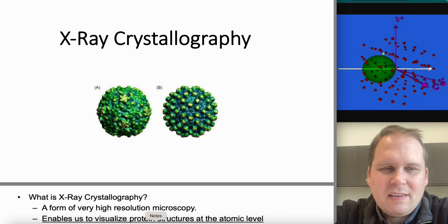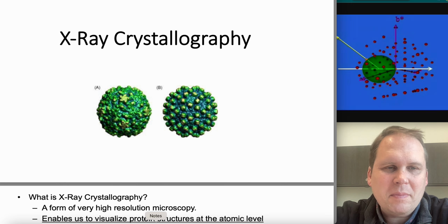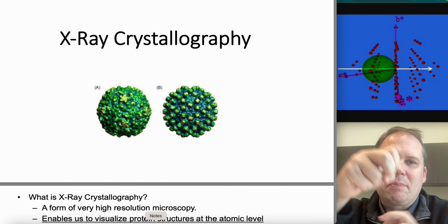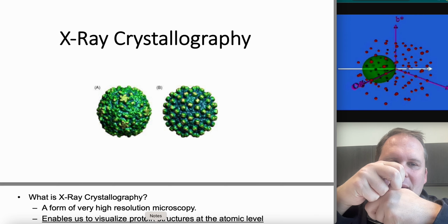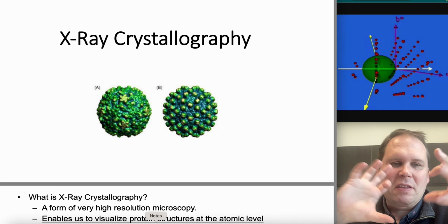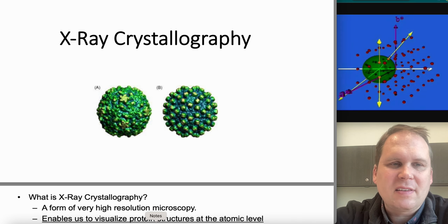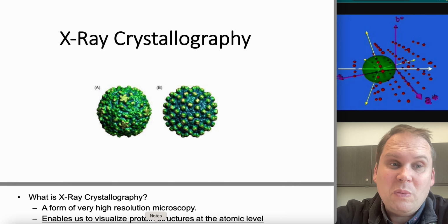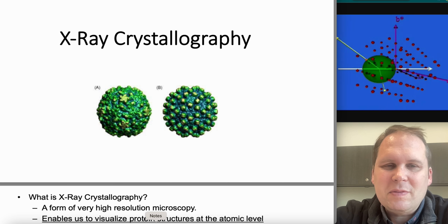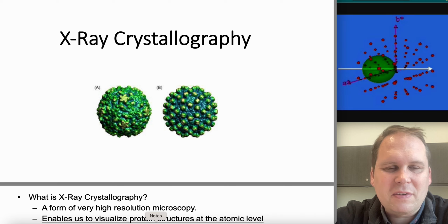That's a technique that works well on any protein that you can get to form a crystal. The crystal will be that protein aligned with another copy of that protein, forming a thing called a unit cell. They'll have other molecules of water, or you can add different agents. Basically, there's no one recipe for how to make a crystal. And most proteins are not crystallized and maybe cannot be crystallized.